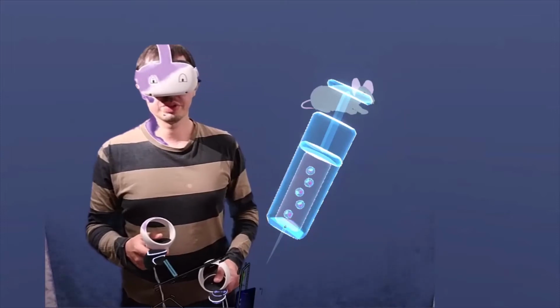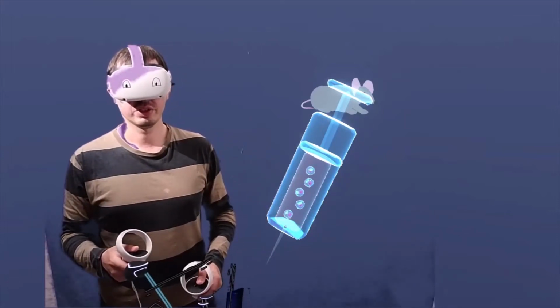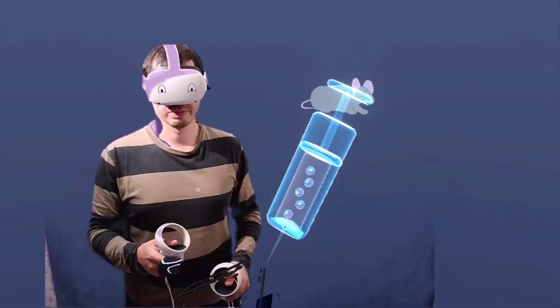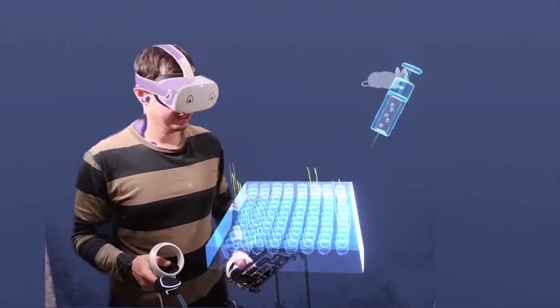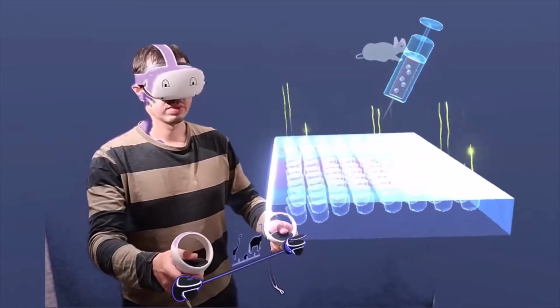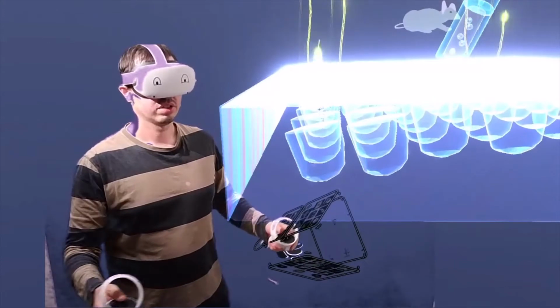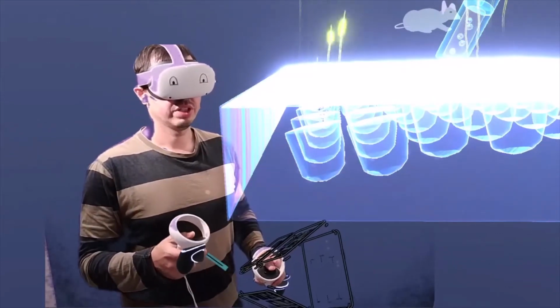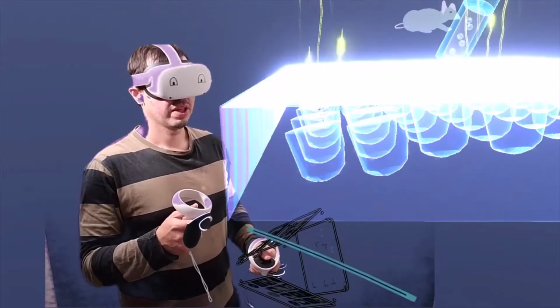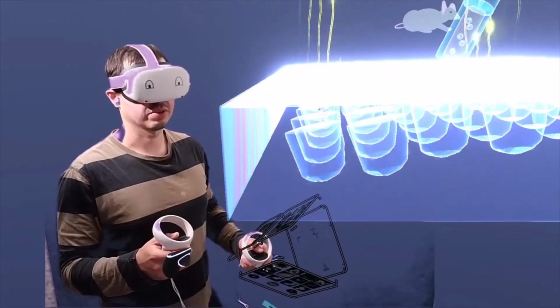There's a rather simple technique, which is very old but works very well: to dilute them a great deal. What you do basically is you have a well plate like this one, in which you have wells. These wells are filled with diluent solutions, and your cells are diluted and split between the wells.